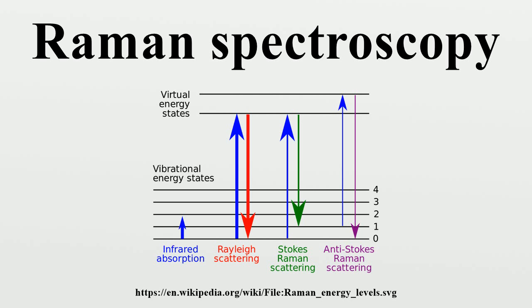Raman scattering is an example of inelastic scattering because of the energy and momentum transfer between the photons and the molecules during the interaction. Rayleigh scattering is an example of elastic scattering. The energy of the scattered Rayleigh scattering is of the same frequency as the incoming electromagnetic radiation.